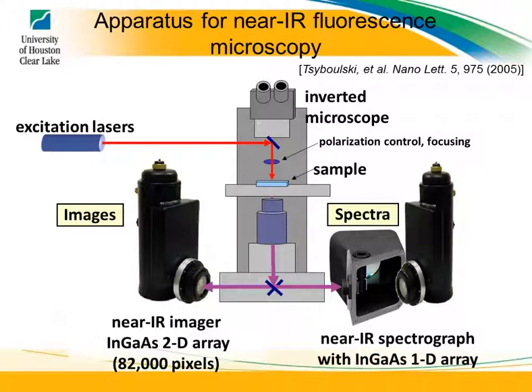And you can position your nanotube at a particular pixel, and then the spectrograph can be directed so it'll pick up the spectrum only from, well, not quite one individual pixel, but about 5 or 6 pixels. So you can position your nanotube right at that one particular spot, and you can pick up a spectrum of an individual nanotube. As long as there's no other nanotubes close, it'll be a pure individual single nanotube spectrum, which is pretty impressive.